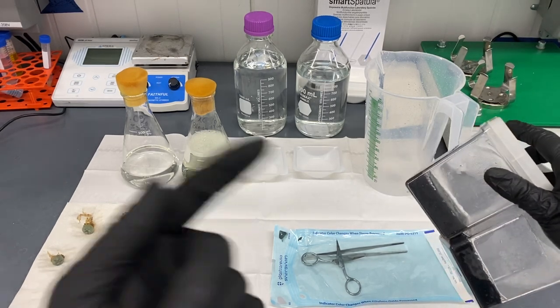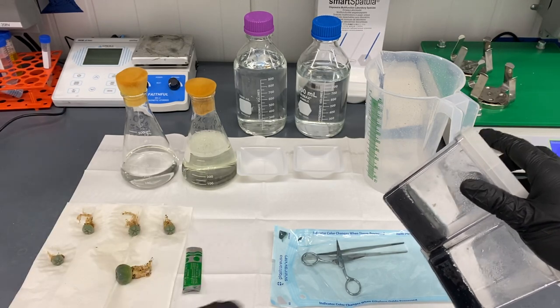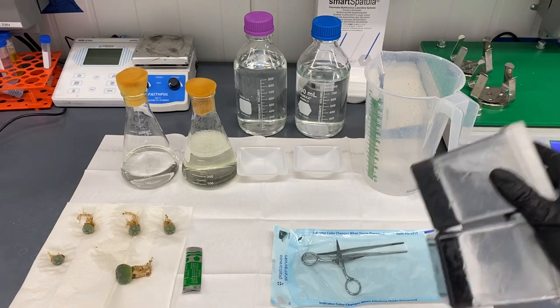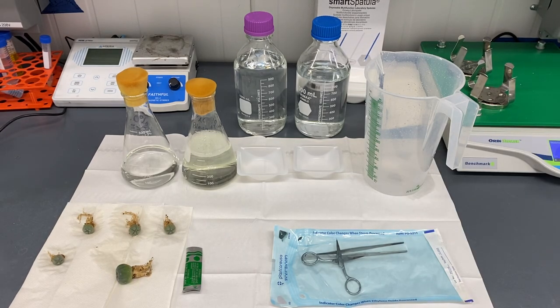We're going to shift over to a flow hood or a sterile area to do the actual tissue culture once we finish the surface sterilization. I'll shift you over there after to show you the hood.